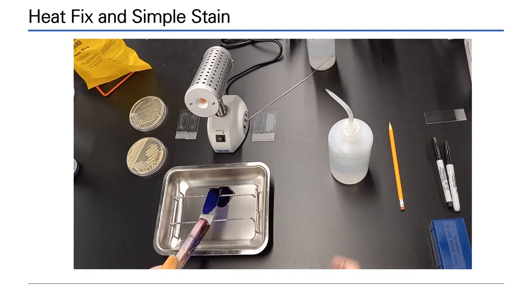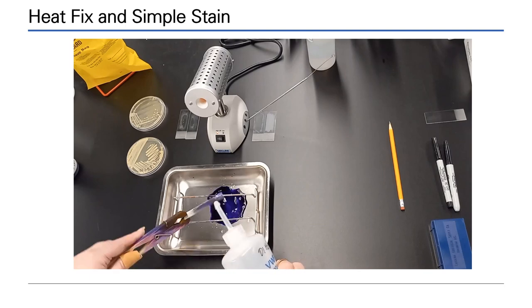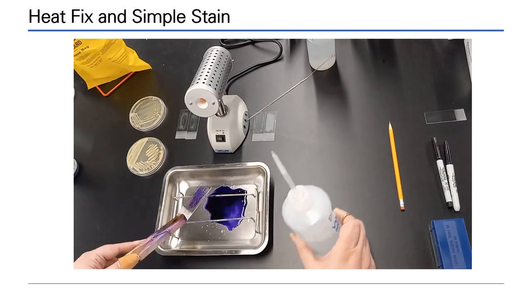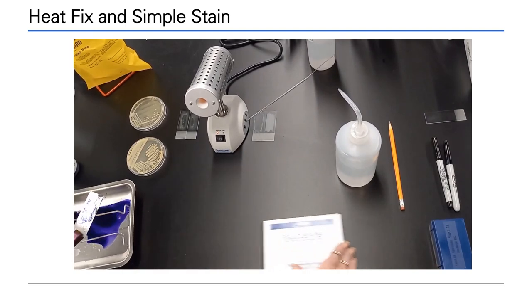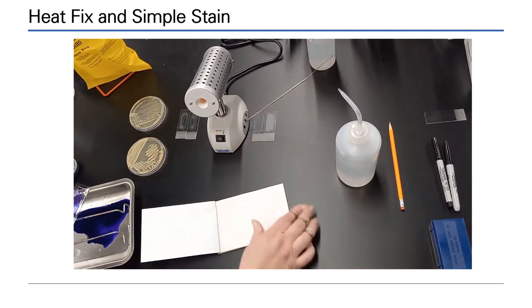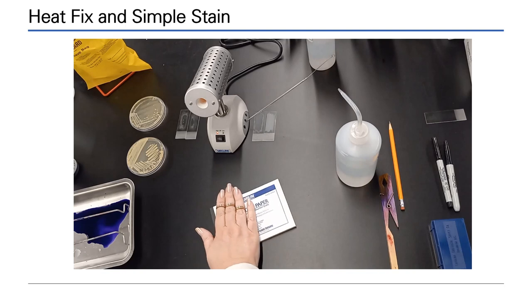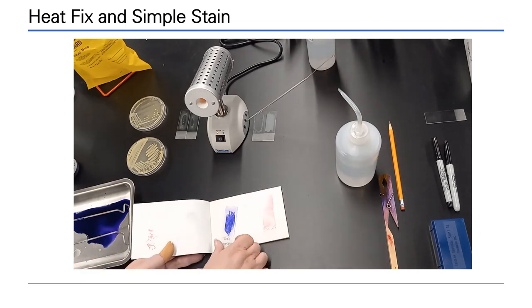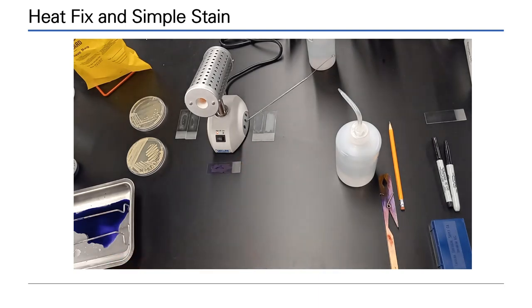After the minute of staining, wash all excess stain from the front and back of the slide. Shake off the water and blot excess water using bibulous paper. The technique for bibulous paper is to place the specimen face down in the book and apply gentle pressure. Do not scrub the surface of the slide. Although excess water has been removed, the slide is not yet dry and must continue to air dry. You cannot place a wet slide on a microscope for observation. It will cause fogging and you will not be able to resolve your image.